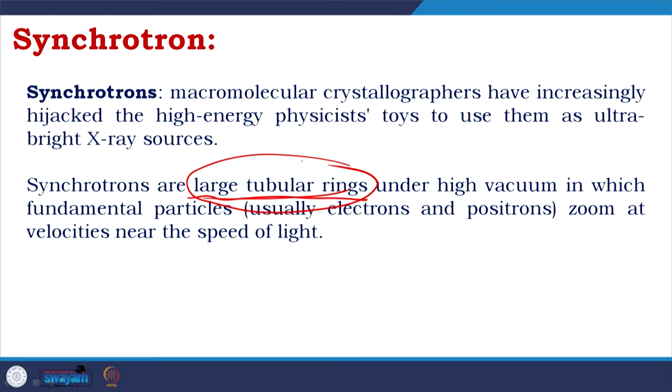Generally, where synchrotrons are developed, it is a tiny town and the beam covers the entire town. Now you can understand. If you are in a small town and your town contains a synchrotron, you will get a circle. The whole circle is surrounding your tiny town, small town, and that is how big the magnet is.